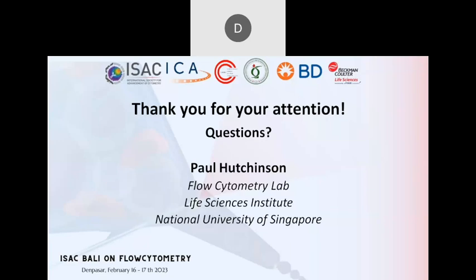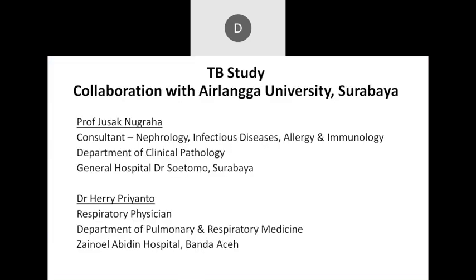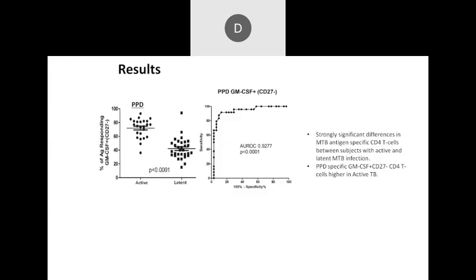Thank you, Dr. Paul. I would say it's not up there with the GeneXpert yet. So this gives you an indication of the sensitivity and specificity. We don't have it listed there, but the area under the curve, that was the best that we got. I don't know the exact values, but I think it's as good as this and getting better. How it compares to GeneXpert, there's been a few studies comparing the two, and I think normally the flow is getting to that sort of range.